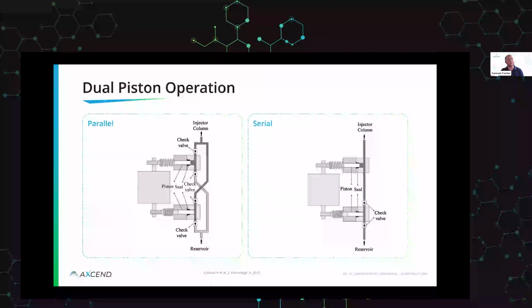In this method, you're able to actually reduce the pulsing by a significant amount when compared to parallel, but it does come with the heavy caveat that this is quite difficult to set up and often requires very special knowledge to get working. And so while it's a little more complicated, it's often a little bit better.